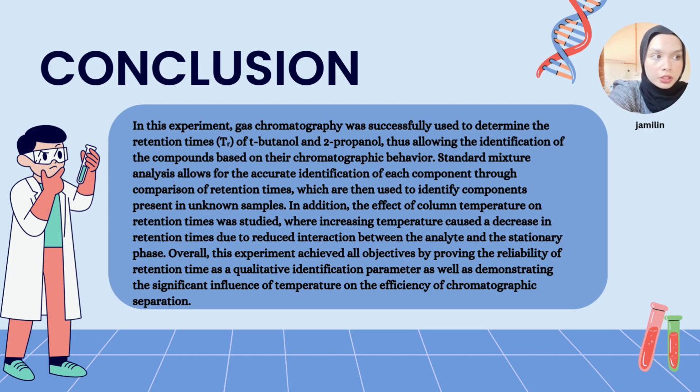In addition, the effect of column temperature on retention time was studied, where increasing temperature caused a decrease in retention time due to reduced interaction between the analyte and the stationary phase. Overall, this experiment achieved all objectives by proving the reliability of retention time as a qualitative identification parameter, as well as demonstrating the significant influence of temperature on the efficiency of chromatographic separation.